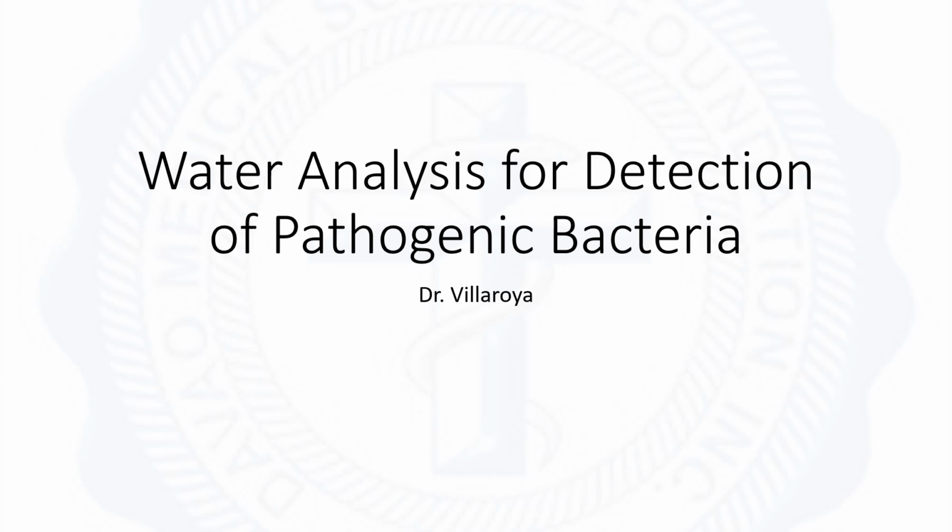So a wide number of pathogens can be transmitted by contaminated water. So it is essential to know whether the water is free of such pathogens or not, and that is the purpose of water analysis. So for today, I will be discussing the common methods for detecting pathogenic bacteria in water.